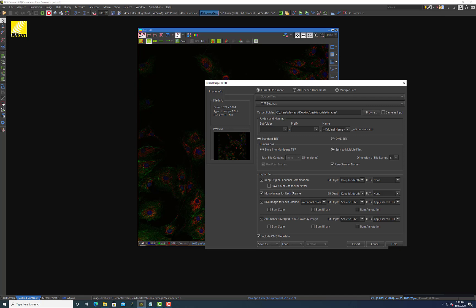And I'm not going to worry about the save color channel per pixel. I'm going to move down now to a mono image for each channel. And that just means that it's going to save each one of your images. So 405, 488, 561 as a separate image, and it's going to look gray. They're all going to be saved as grayscale images. From a microscopy point of view, this is really what you ought to be working with if you're going to be messing around with your images for quantitative analysis or trying to merge those images later on in say Fiji to get a better lookup table.